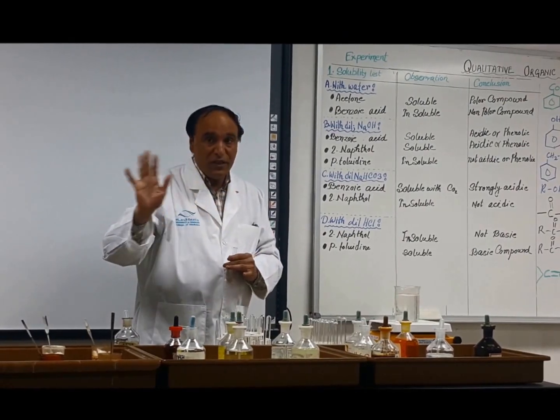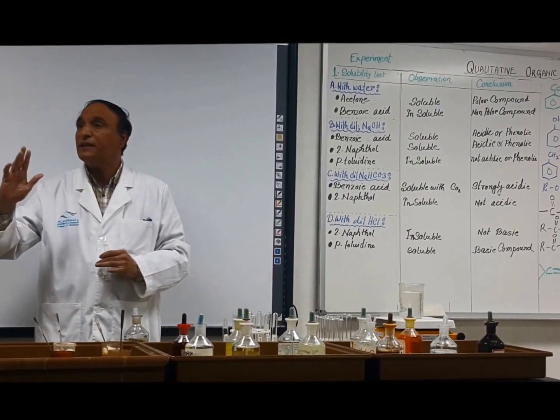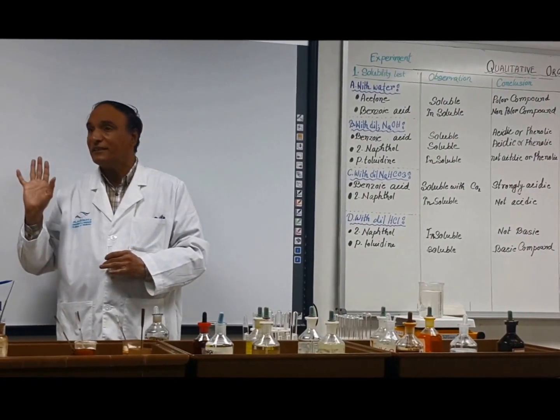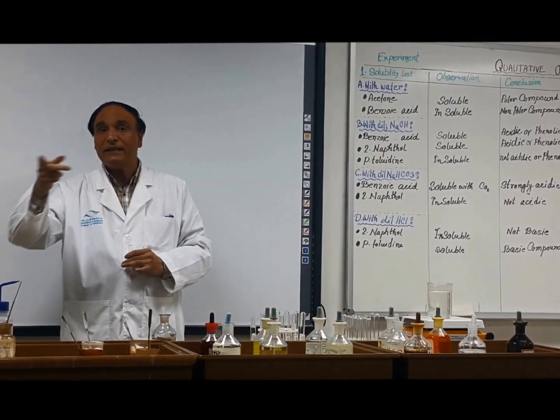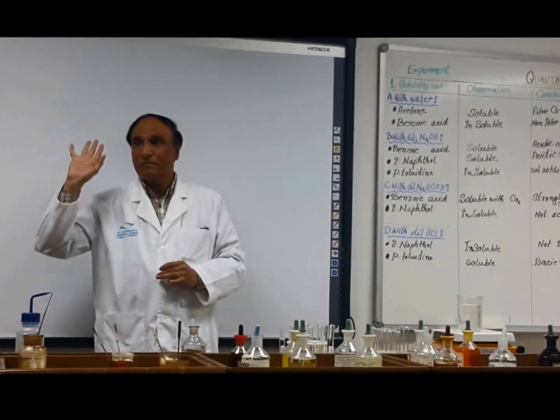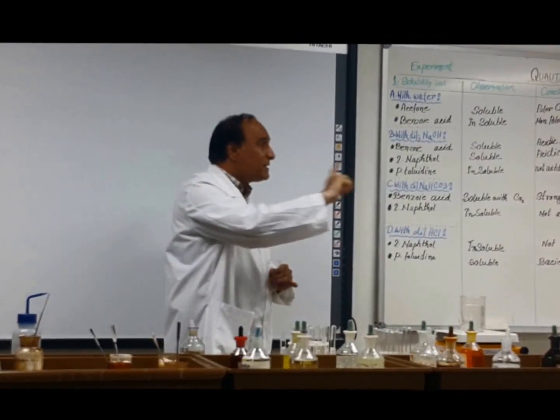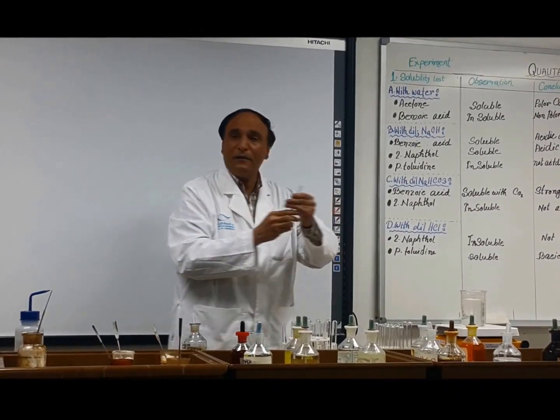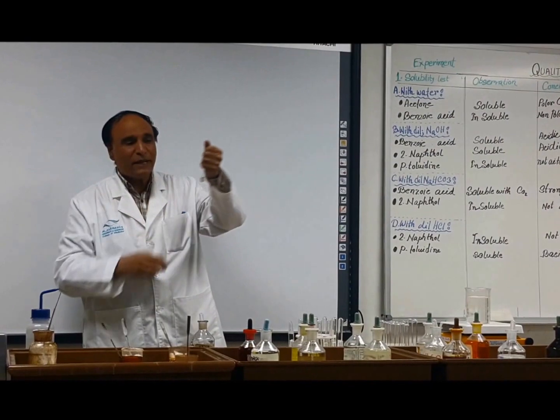Okay? So when you are doing these things, make sure that you understand. Again, I am telling you one thing. I am not concerned with the result. You know me, I am giving the full grade, even if the result is not good. But your technique should be excellent. So when I am doing, for example, look, you can hold the test tube like this.